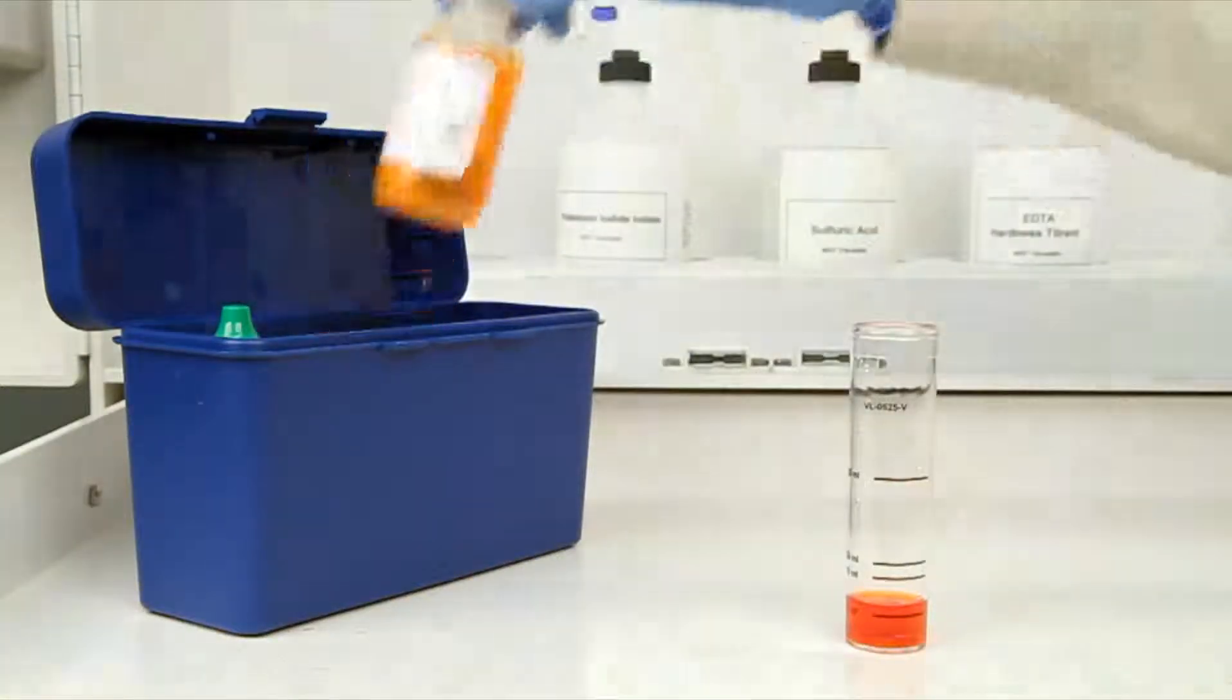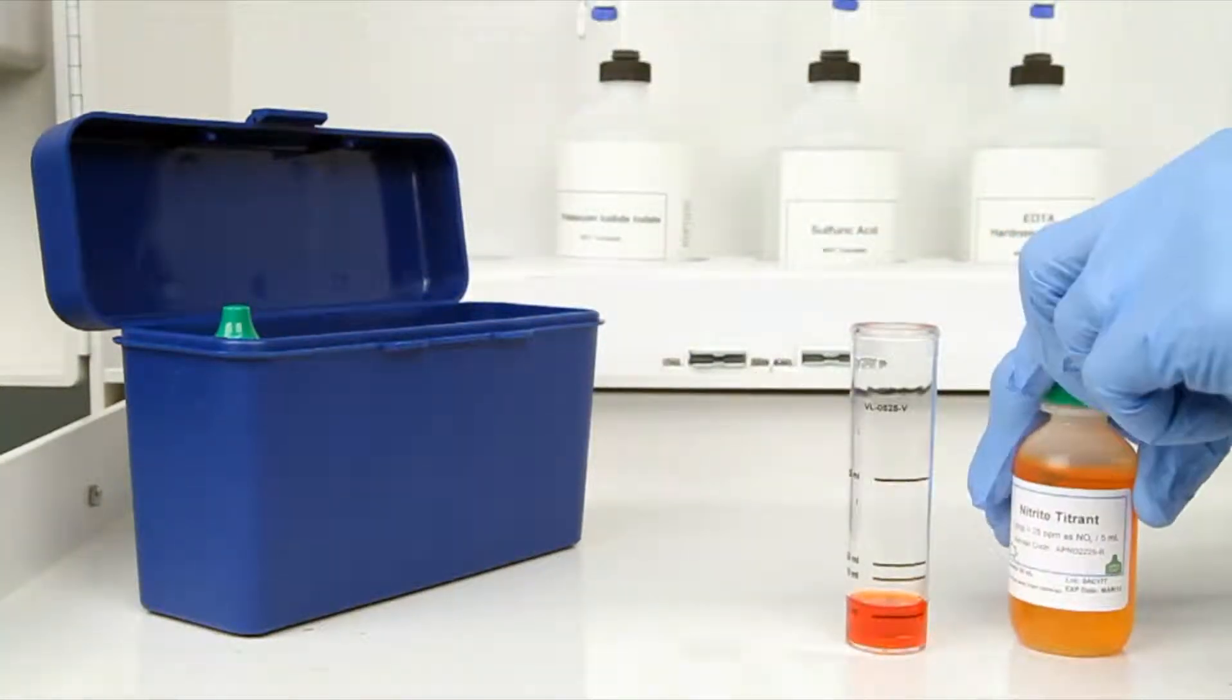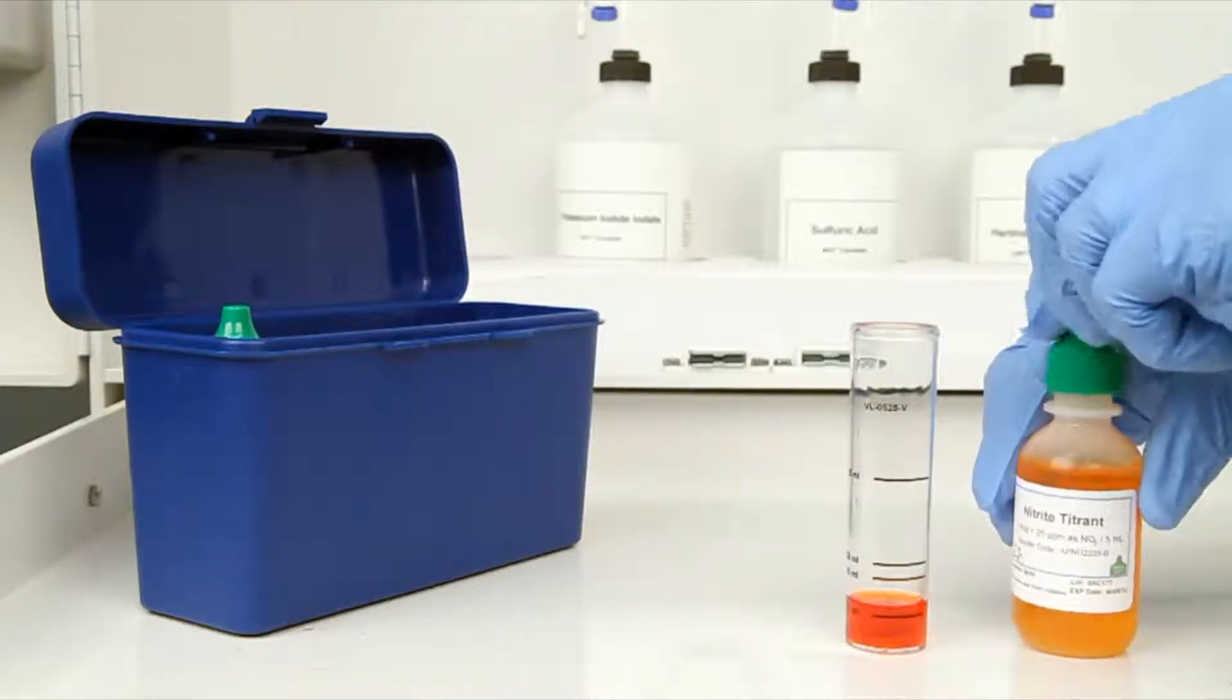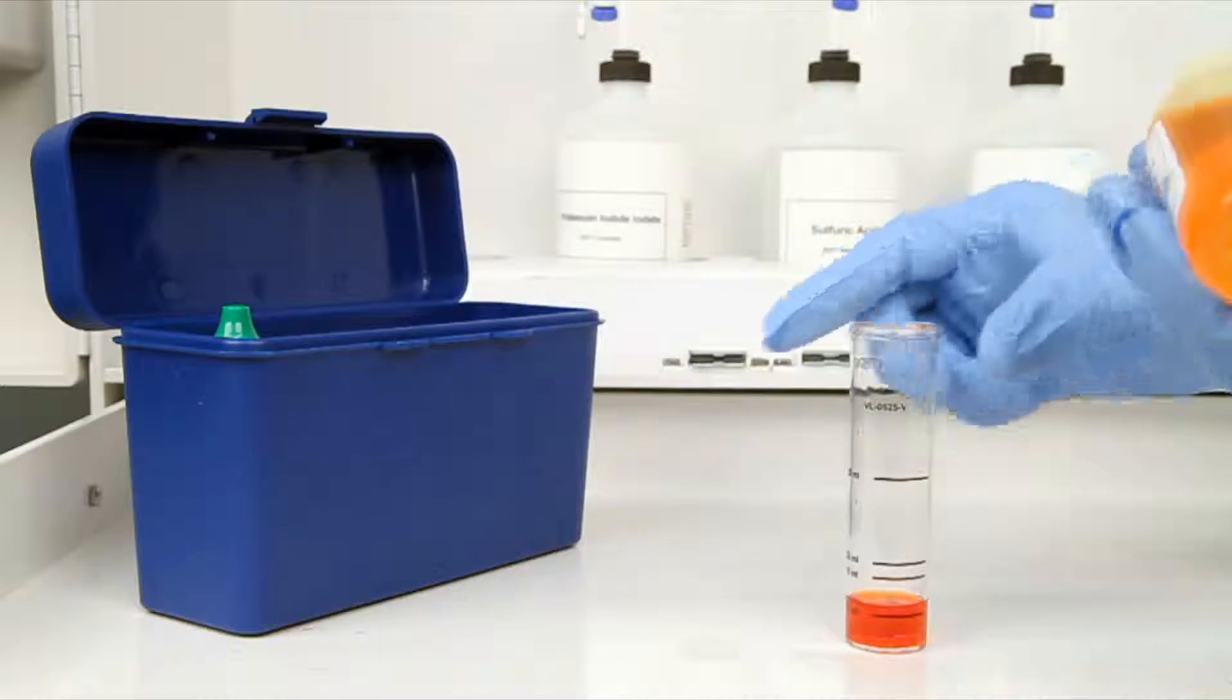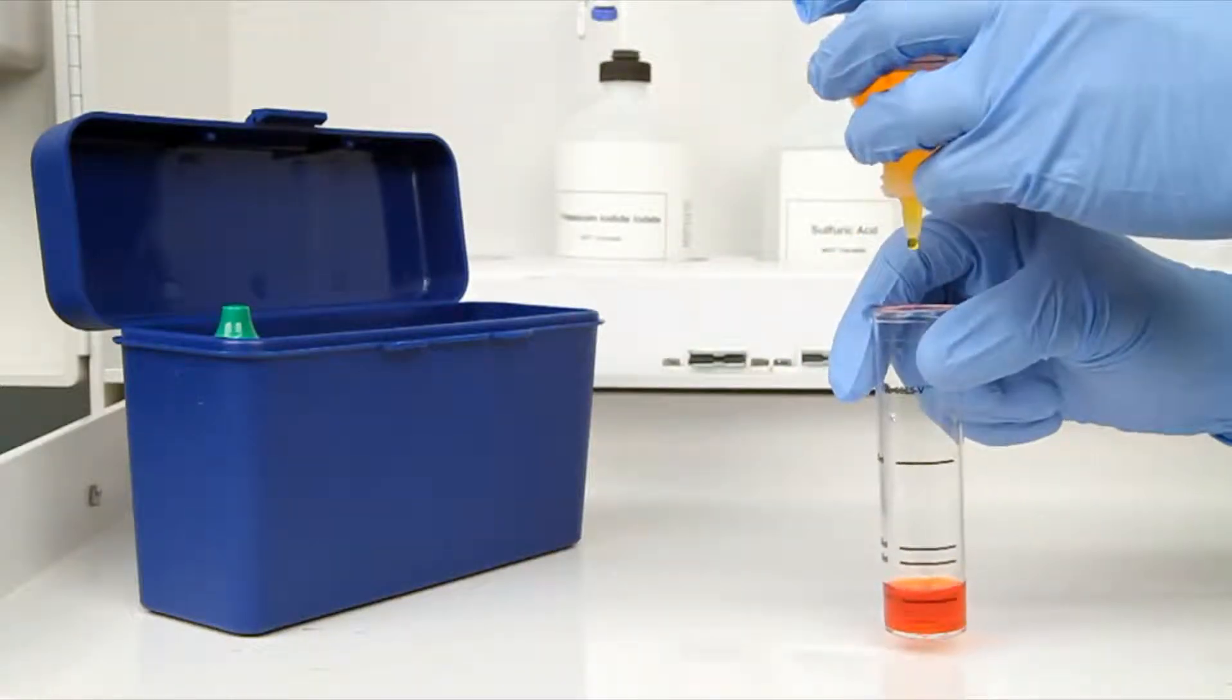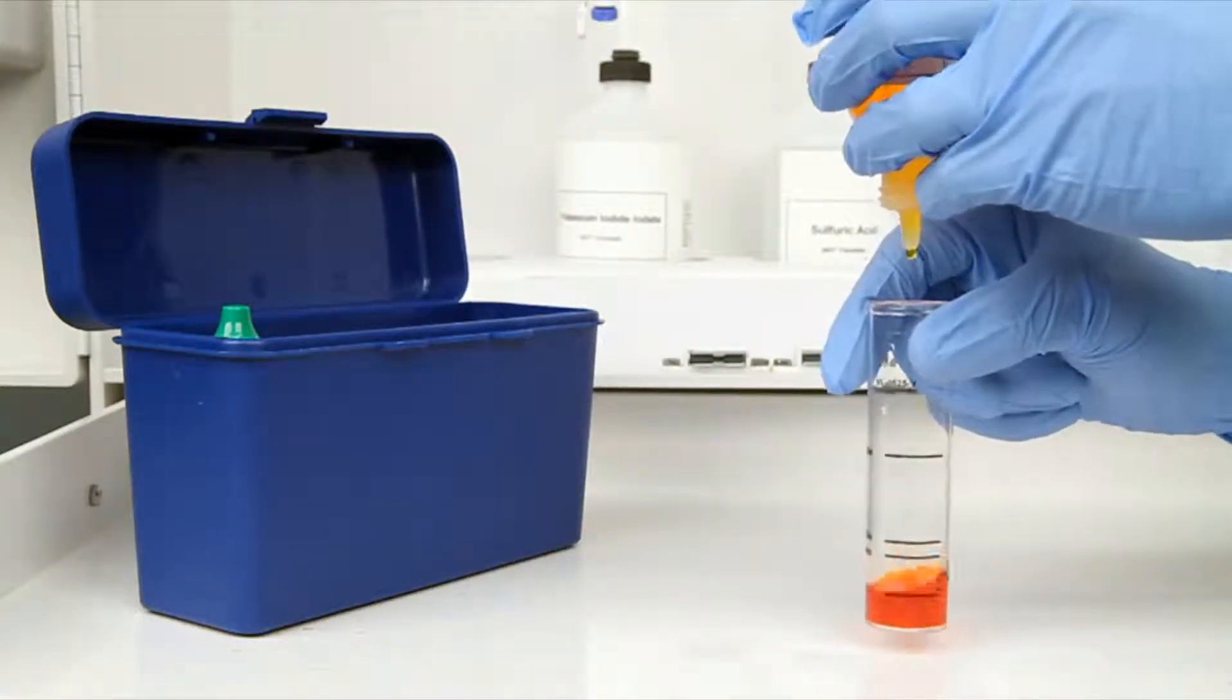The next step according to the endpoint ID procedure is to perform the titration. Each bottle of titrant is labeled with the equivalency and sample size it was manufactured for. It's important to make sure you have the proper titrant and the proper sample size for this titration.